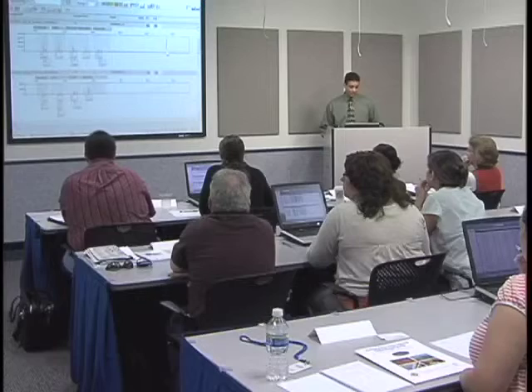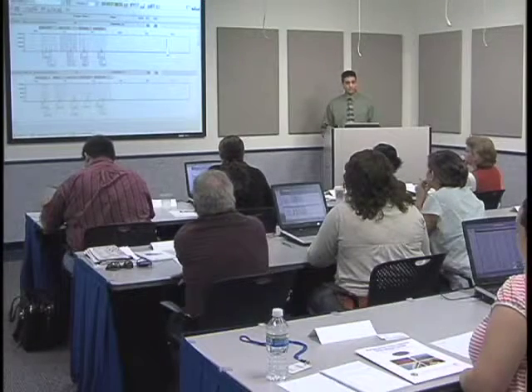Because you're seeing it happening again. And then this one, whatever 33B was, that didn't work. The A was off the old column. Okay, so the A was off the old column, and then the B was when we redid it. When you redid it. Okay, right. So obviously that process of redoing it isn't actually going to fix it.